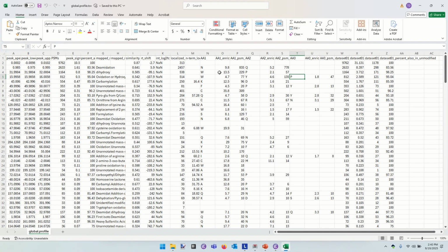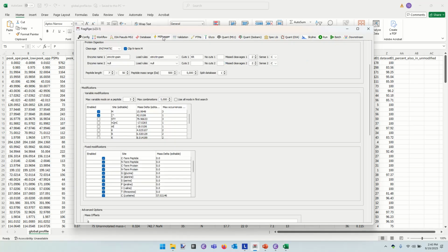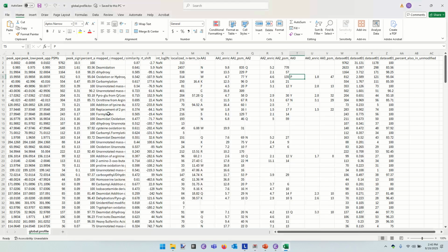That's right. When we configured our MS Fragger search, under MS Fragger, we had listed methionine as spontaneously oxidizable as a variable modification. Variable modifications are handled separately from unknown modifications. So these unknown modifications are all the cases that are not included in the variable set. Okay, so that's valuable to know. We see that things other than methionine can also get adventurous and gain oxidation.